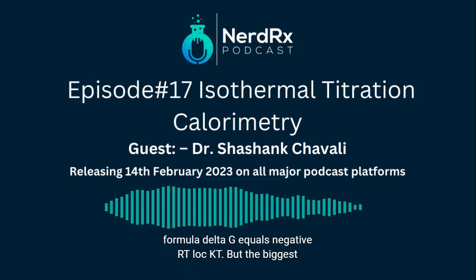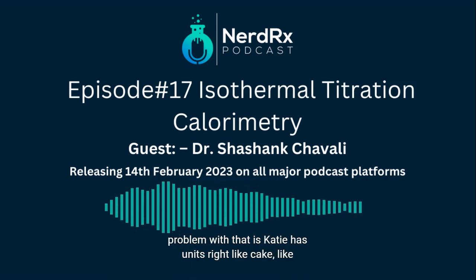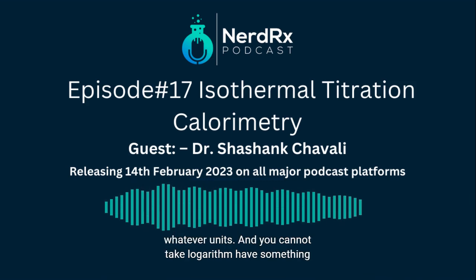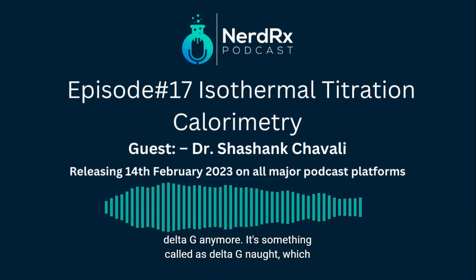But the biggest problem with that is KD has units, right? Binding affinity has micromolar or millimolar or nanomolar units, and you cannot take a logarithm of something that has units. So it's not delta G anymore.